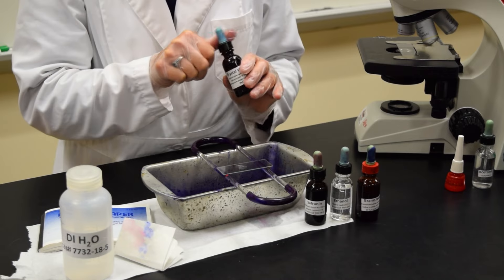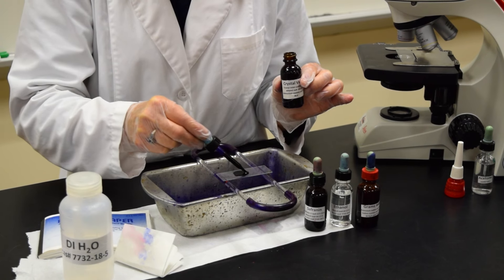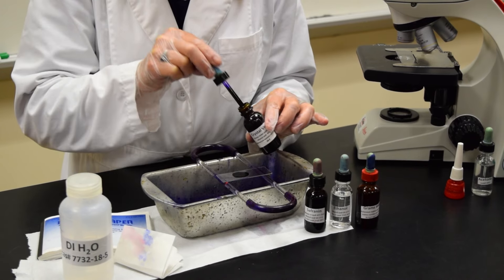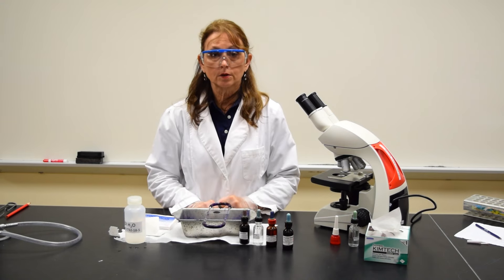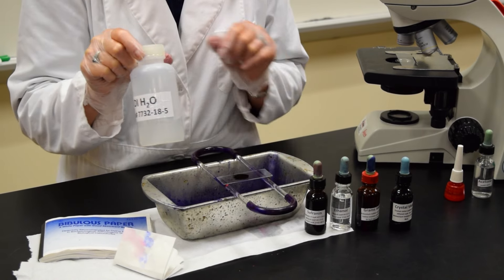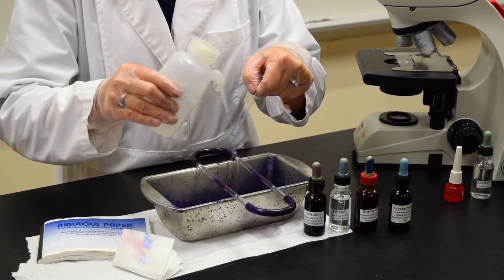Start by taking the crystal violet and add several drops to the smear. It's okay to take the dropper and touch the slide and spread it around so the area is completely covered. Allow the crystal violet to remain on the slide for 30 seconds. After 30 seconds, using the deionized water in the squirt bottle, tilt the slide over the tray and rinse the slide.